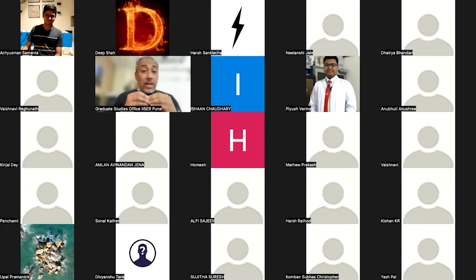And so you can take a fluorescence image and compare it to an electron microscopy image. You can take the same fluorescence image, deconvolute it, compare it to the electron microscopy image of the same thing, and see what actually looks closer to the real thing. And so evaluations like that have been done to say why deconvolution by a particular algorithm actually is good or not.